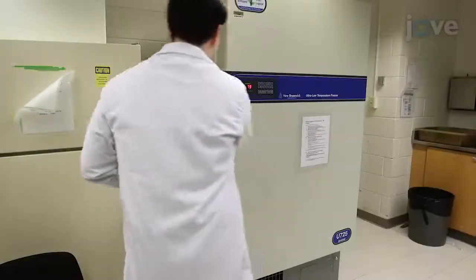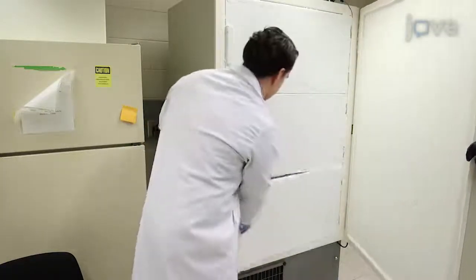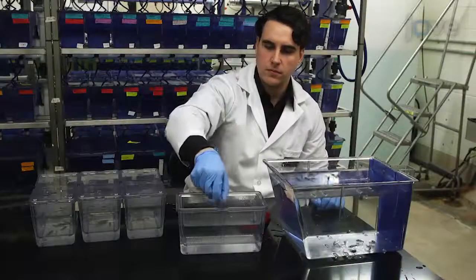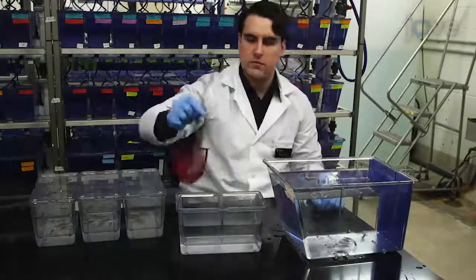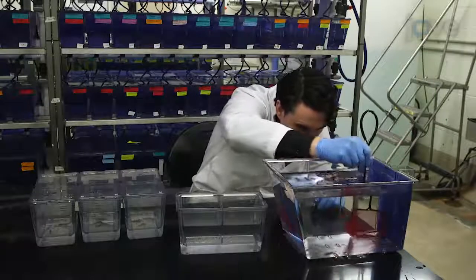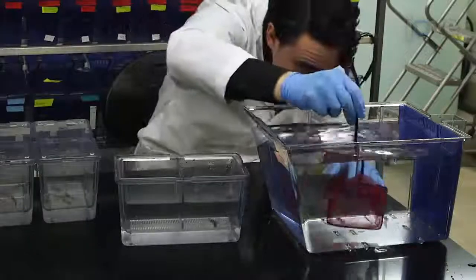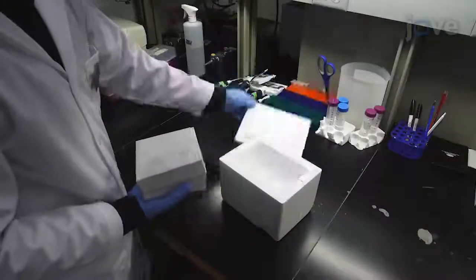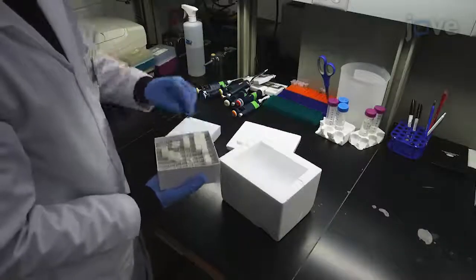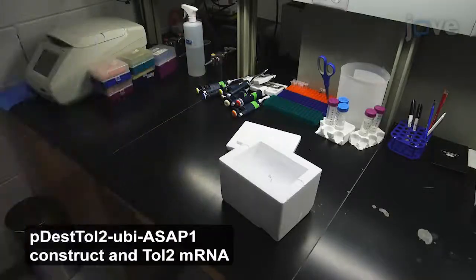After preparing Tol2 transposase mRNA and injection solution according to the text protocol, the afternoon before injection, set up four to six breeding tanks with at least two males and two females. To reduce the amount of fish waste and to induce a breeding response, avoid feeding the fish in the afternoon. The following morning, remove the prepared injection solution from the negative 80 degrees Celsius freezer and place it on ice.